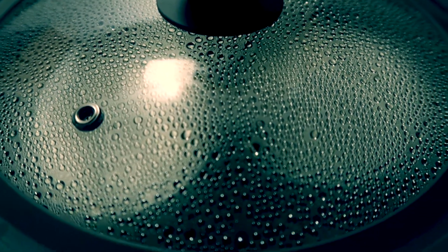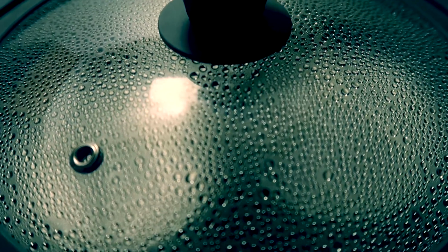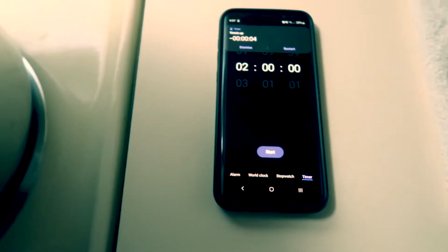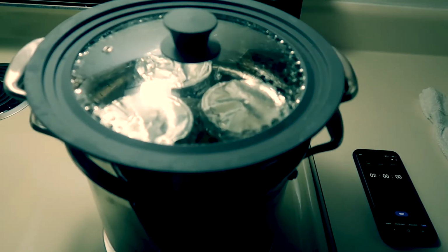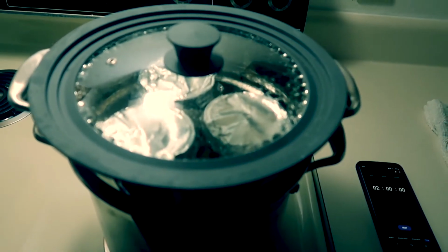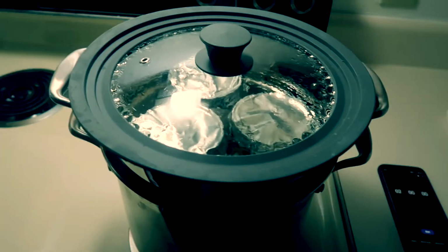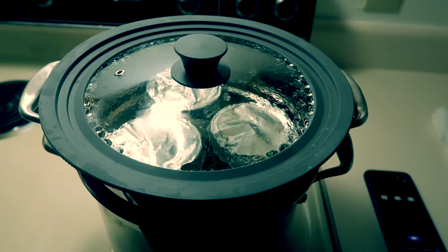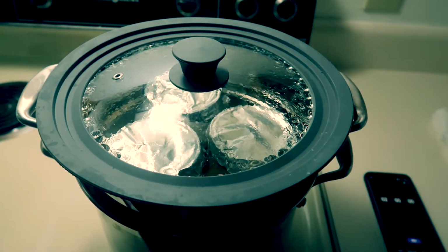But in this case, with our unmodified lids, this isn't an issue. I just use the foil as a sort of dust cover. 2 hours is up, so that means I'm going to turn this heat off and leave it off. You can see that preparing your own popcorn for mushroom grain spawn without a pressure cooker is pretty much an all evening affair. If you've made it to this point of the day or the night, it's probably time for you to go to bed anyway.